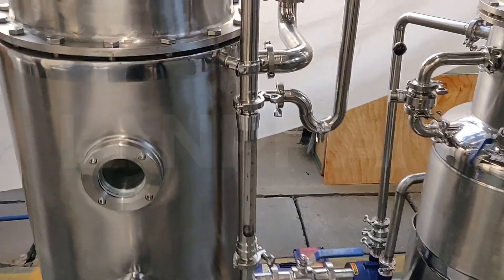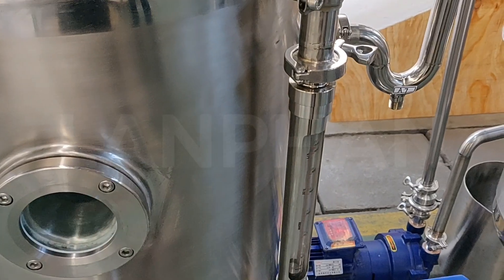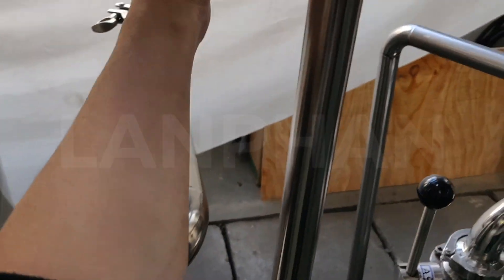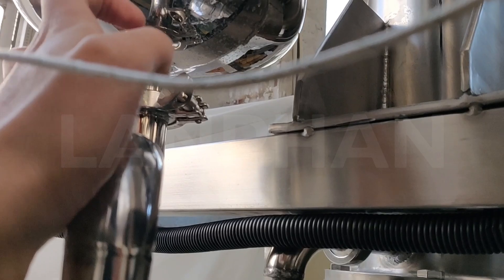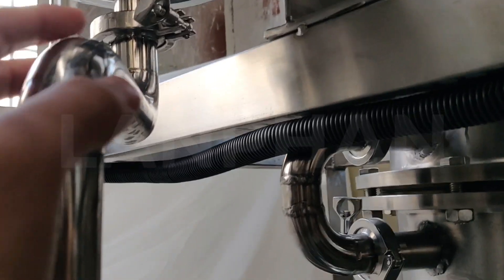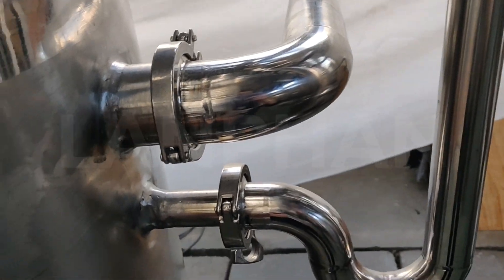With the heating, the solvent will become steam. The steam will come up through this pipe to this tank, and some of the residue oil will reflect from this pipe and come back to the tank again.